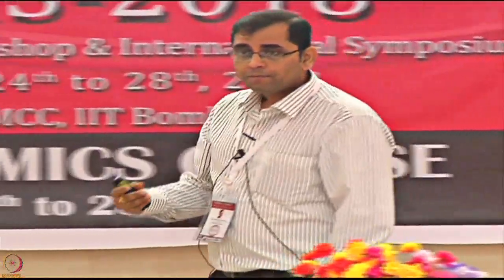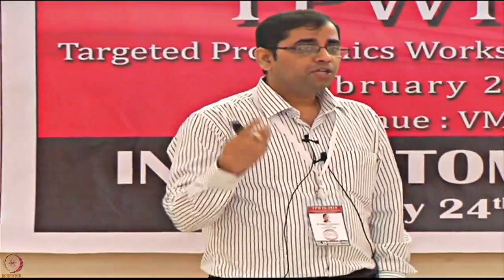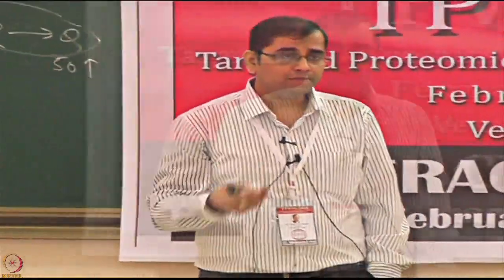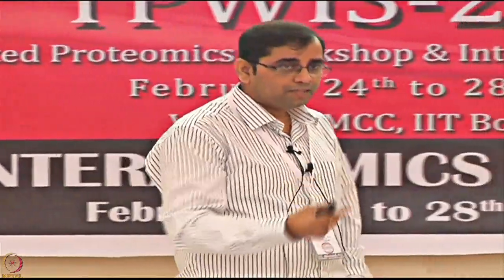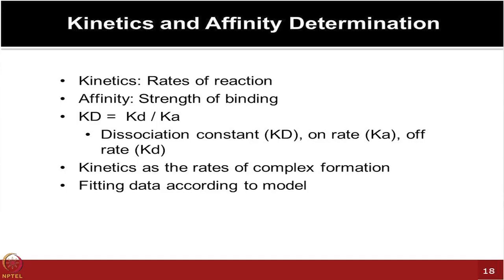Many of these pieces of information have a lot of utility in the pharma sector, and that's where we see that, more than academic labs, Biacore and SPR and many of the label free technologies are heavily used by the pharma sector, doing drug discovery, drug designing and drug testing kinds of experiments. They have a lot more utility for using these platforms, because just having binding information is not sufficient. How the binding is happening, and on rate and off rate differences, are much more crucial to know over there.